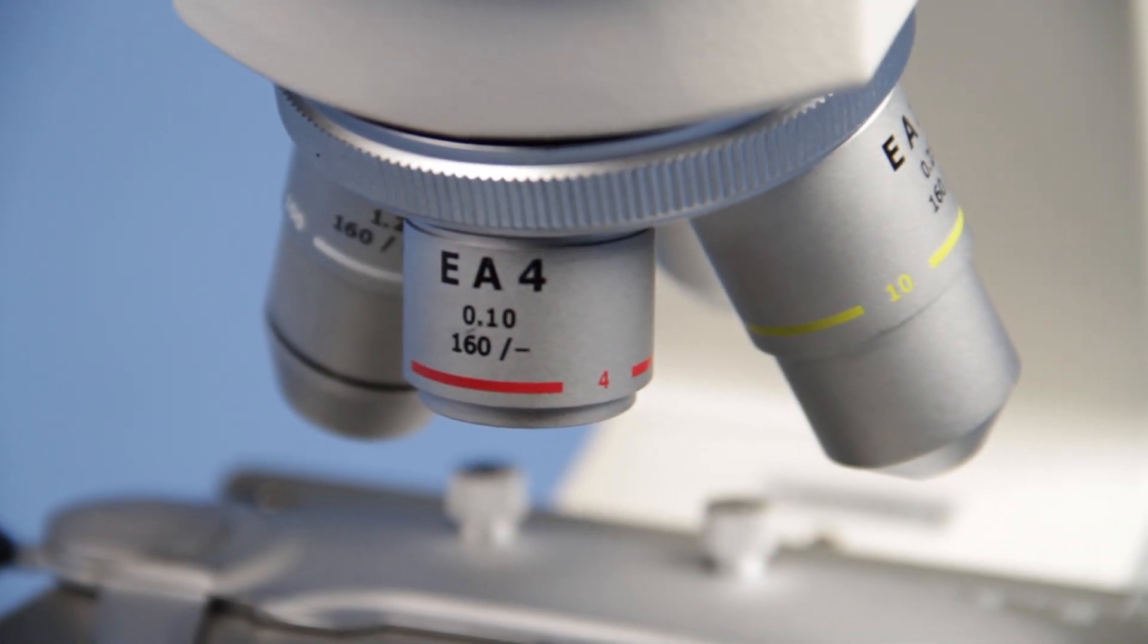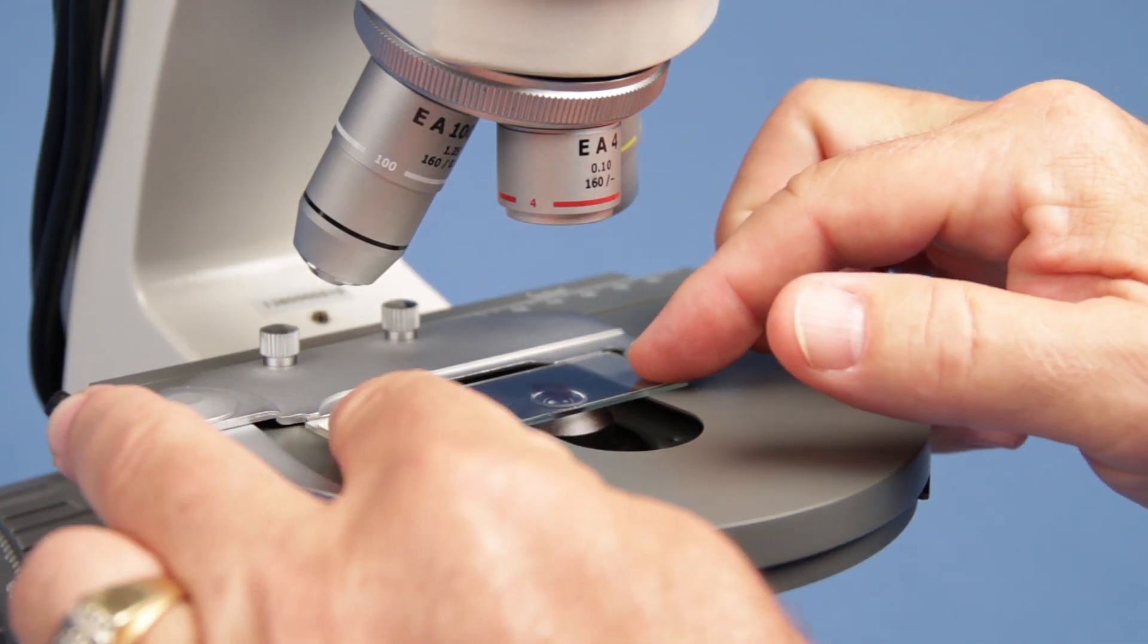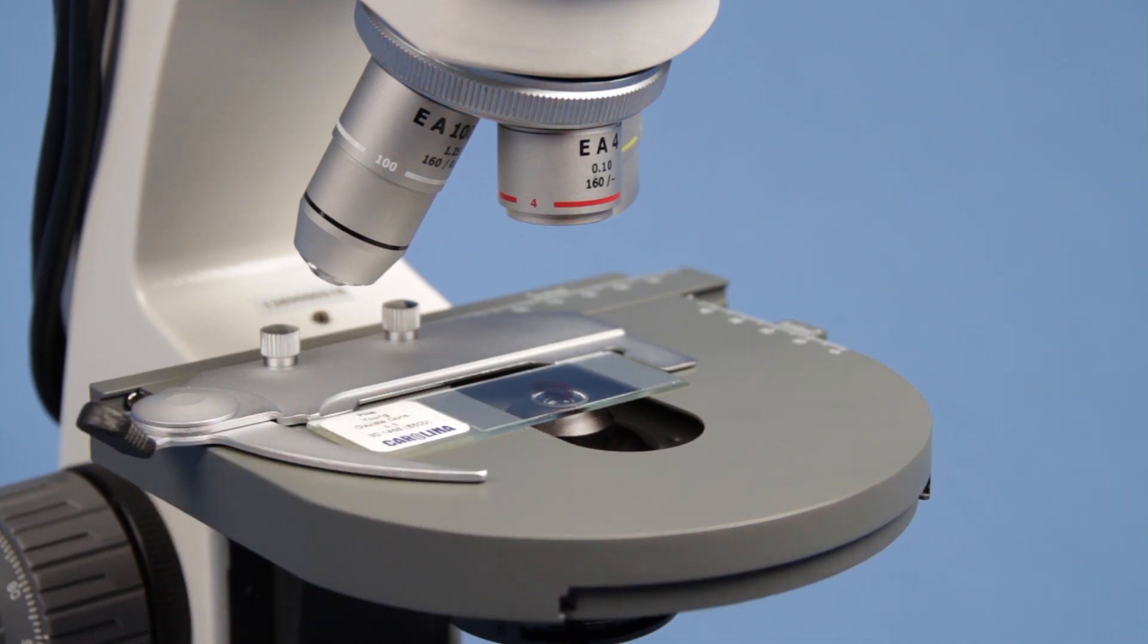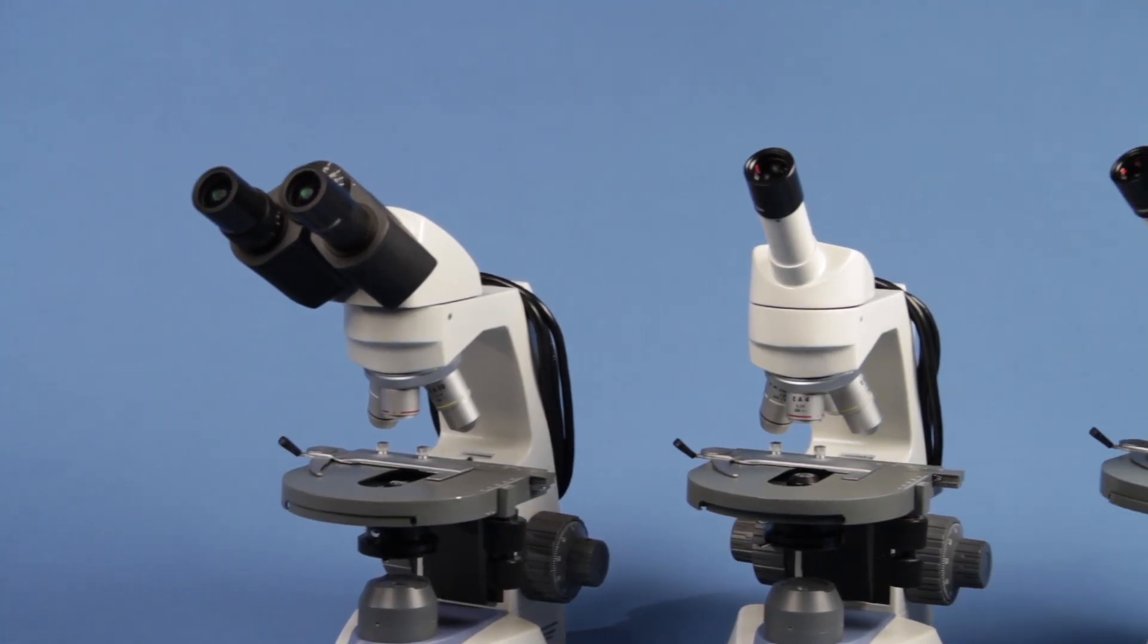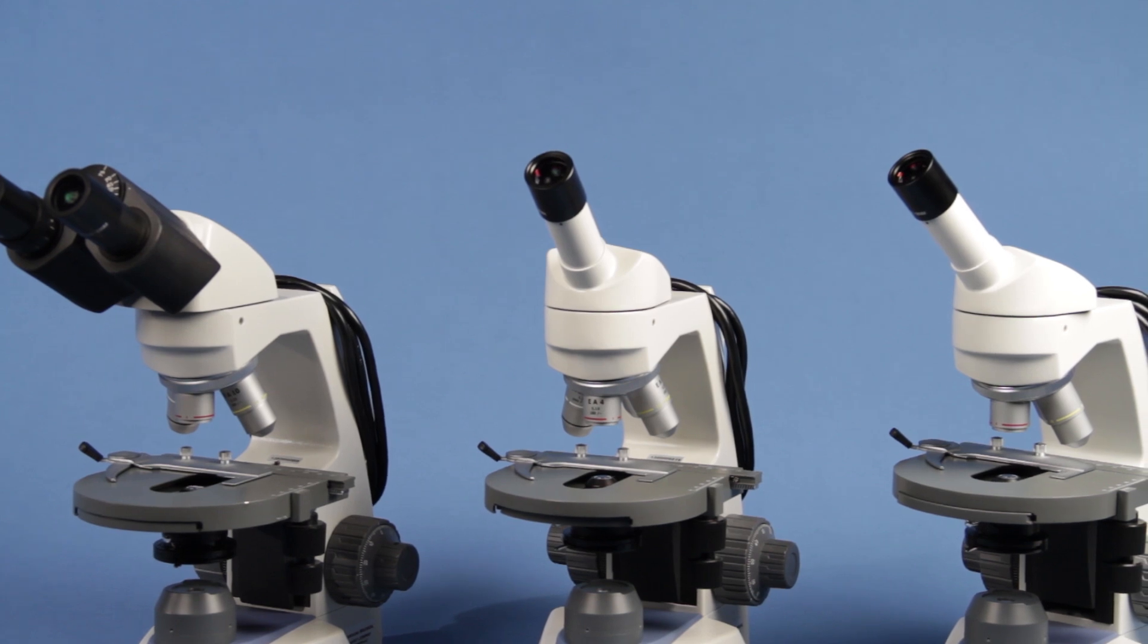Advanced EA Achromatic Objectives provide superb optical quality with excellent color reproduction, contrast, and field flatness. A reverse mounted quadruple nose piece positions the objectives away from the user for easier slide placement and manipulation.